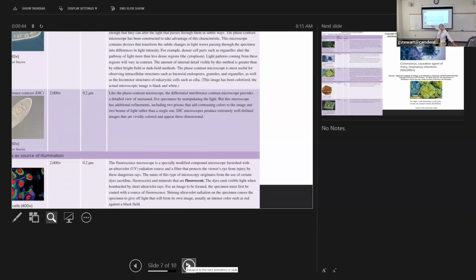Can you see this over here? Right. There's an example of using a fluorescent microscope. Can you see that they've used 3 different colors of dye? We've used a blue, a green, and a red. Those are eukaryotic cells. You can see the nuclei are red. So those are really large cells. And we're only magnifying 400 times the size of life. But you can get more, like I said, you can label specific items, or you can find things that are rare to find.